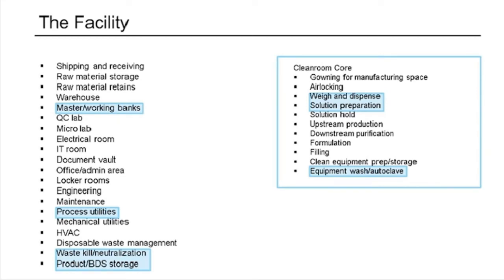And then what we are starting to see in single-use facilities is a bit of a trend: if all of your equipment truly is single-use disposable, the need for equipment wash and autoclave systems, so things like GMP washers and GMP autoclaves, which are fairly substantial systems with fairly decent lead times and are critical to lining out your facility infrastructure because they are typically installed in the walls and mounted to the floors.